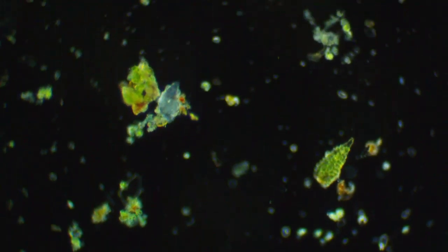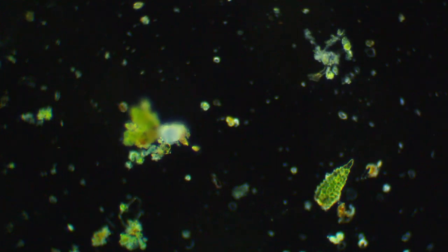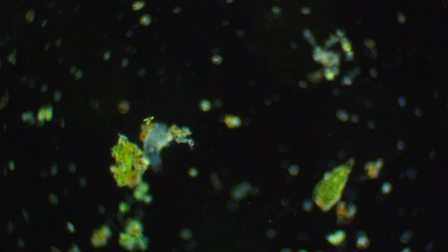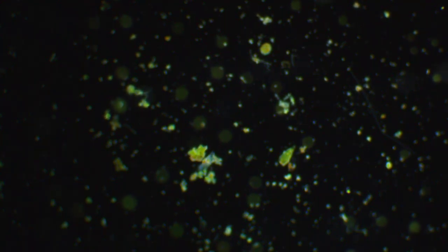So there's Rob the rotifer, just, you know, doing his little rotifer thing. Let's see what else we got in here. So I'm going back out to the first objective. Gonna move my box out of the way here.